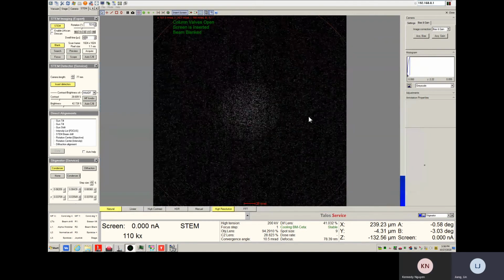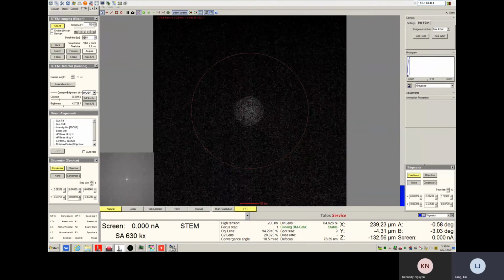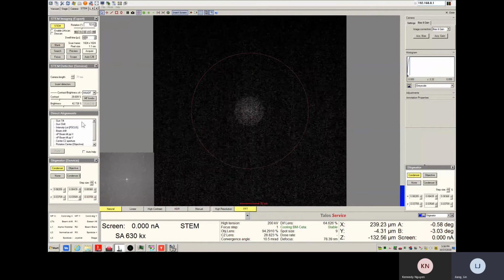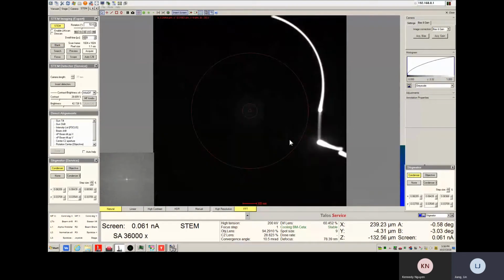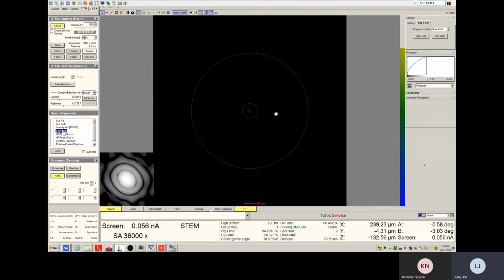Another thing, it's good to check by going out of direction, to make sure you're still good, as I mentioned, because we went through that direct alignment last time. So you want to make sure you've got a good beam, because I haven't taken a look at that yet. I think it should be close. But let's take a look. Oh, actually, it's not close. A little bit off. I loaded that characteristic from that file.